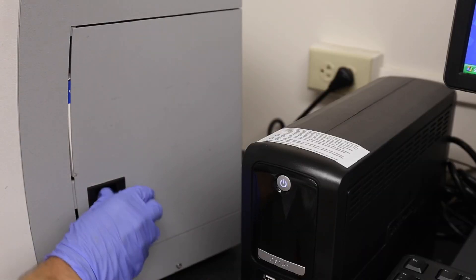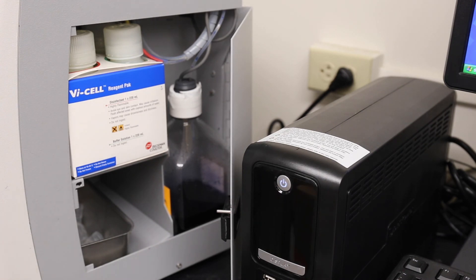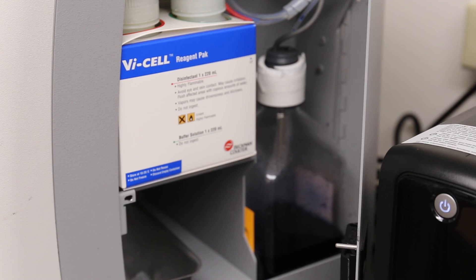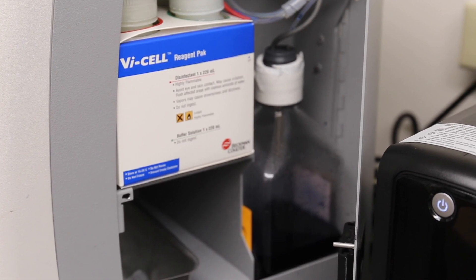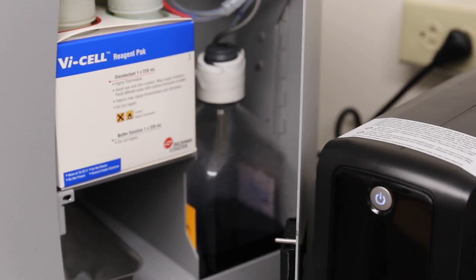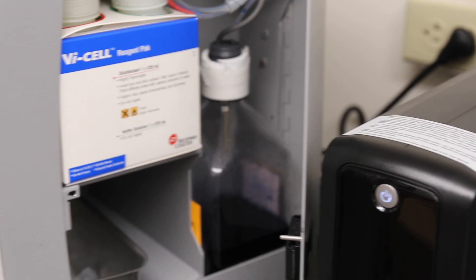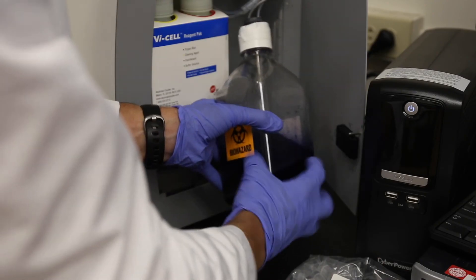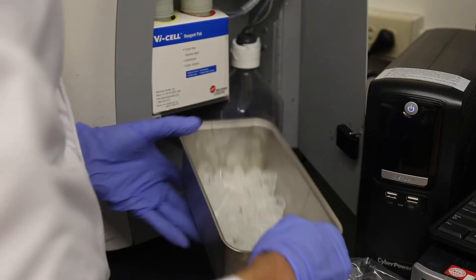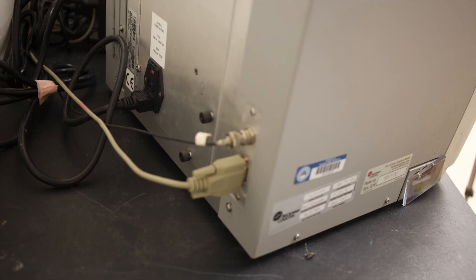Here we have the side panel where the reagents, the waste bottle, and the used cell cups are stored. There are additional sensors on each of the tubes so the computer will alert you if reagents run low or if cell waste becomes too high. Before beginning a trial, make sure the waste bottle is less than half full and the container holding the used cell cups is less than half full.